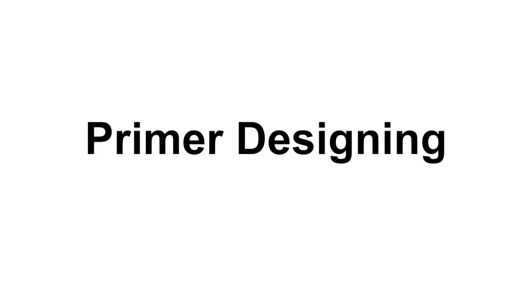So we have prepared a small demo clip where we have explained how you can design the primers, and the students have taken full care to first show you the manual method of how you can design the primers, and then subsequent to that they have also shown you the automated method where you can use different software, and it will give you the designed primers. Hello everyone, in this video I will show you how to design the primers and analyze them.